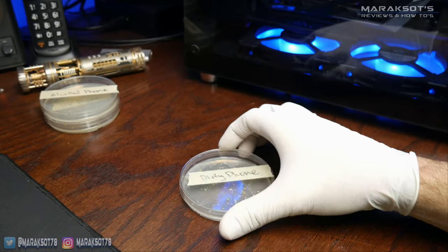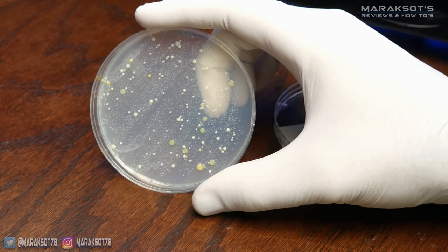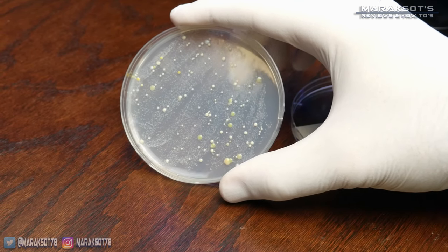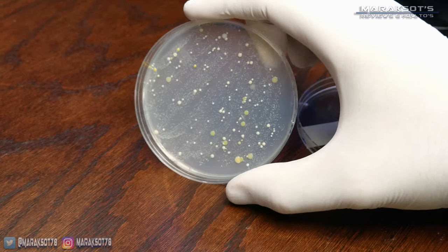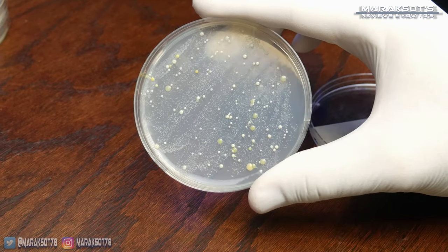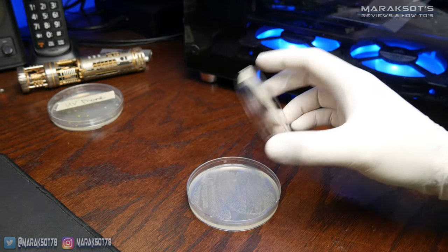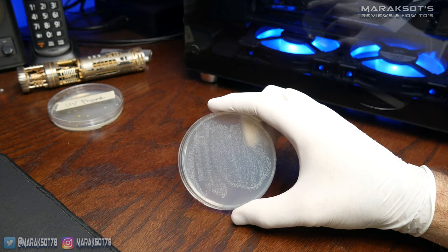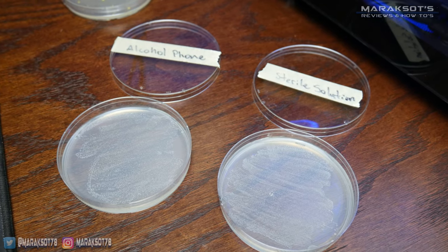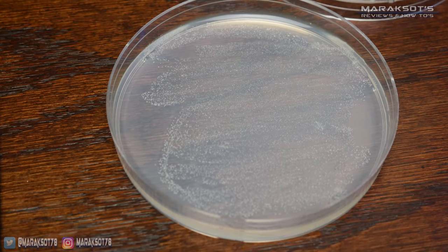The third plate was of my dirty phone screen, and now we've got something to look at — it has all kinds of bacteria colonies growing on it. How dangerous or harmful these bacteria are I don't really know for sure, but I would assume they're mostly stuff we as human beings are exposed to every single day. This is why our bodies have an immune system to protect us. The fourth plate is the sample from the bottom half of my phone screen, which I cleaned with isopropyl alcohol, and it looks pretty much identical to the plate I'd only applied the sterile solution to. You can see where I swabbed it onto the agar, but there are no bacteria colonies growing anywhere.